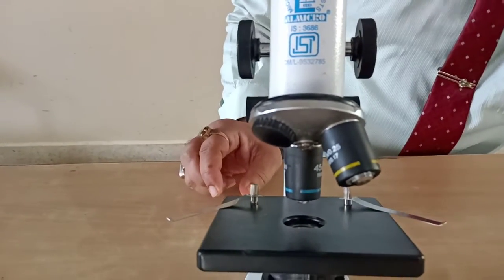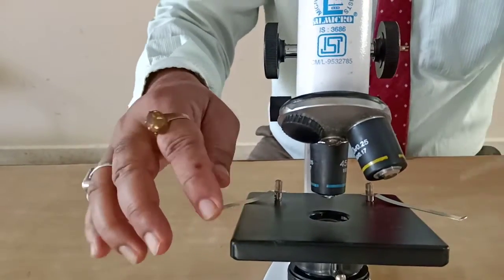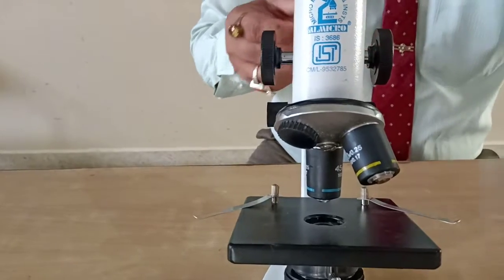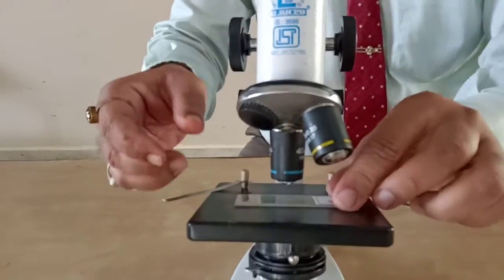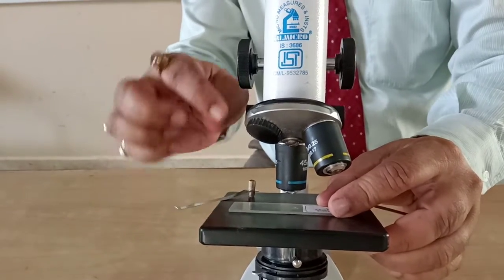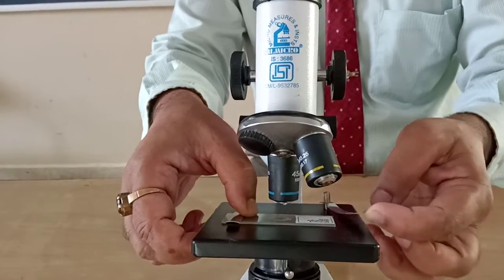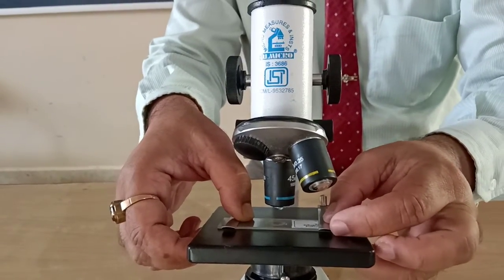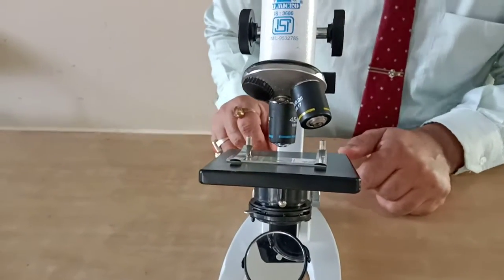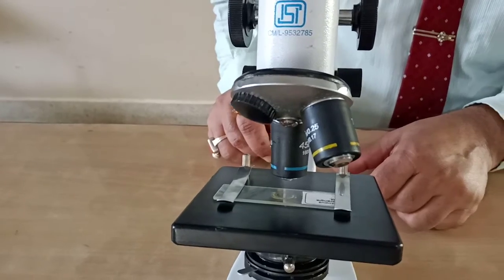Suppose this is the slide, and this black one is the stage. On the stage I wish to set the slide. So this is the slide I have taken, and I would like to fit it. We have to hold the slide with the help of stage clips. So now the slide has been fixed on the stage. Now let me come to the multiple lenses.